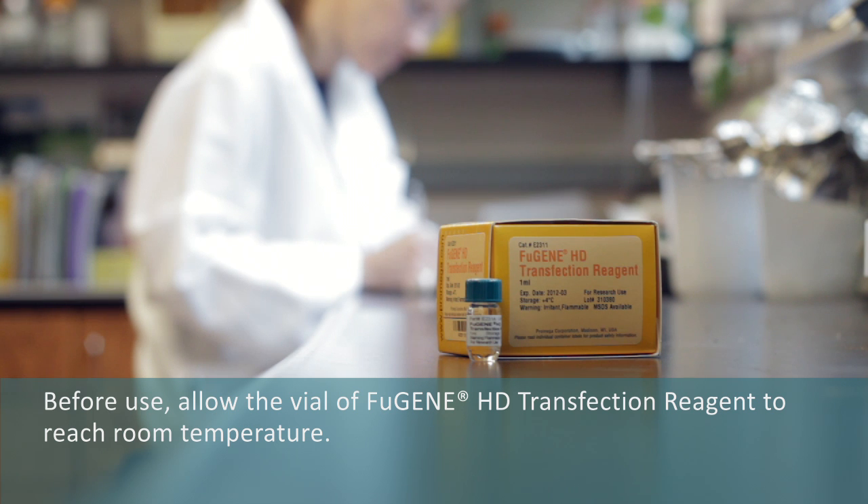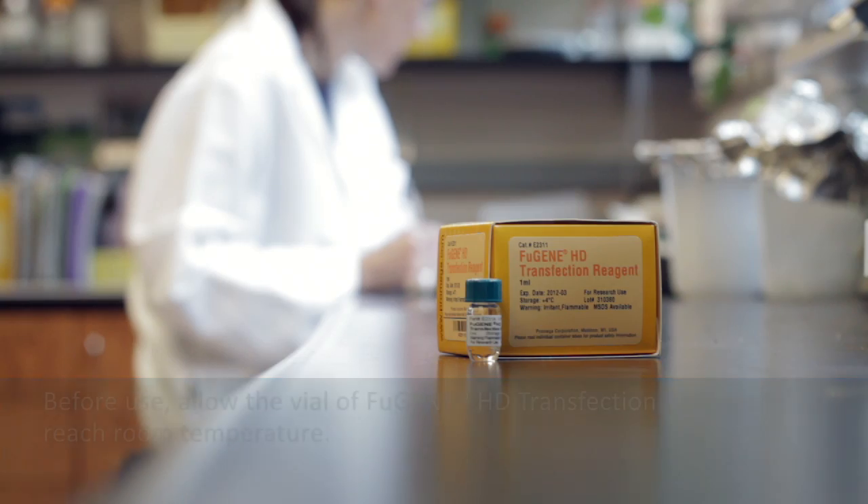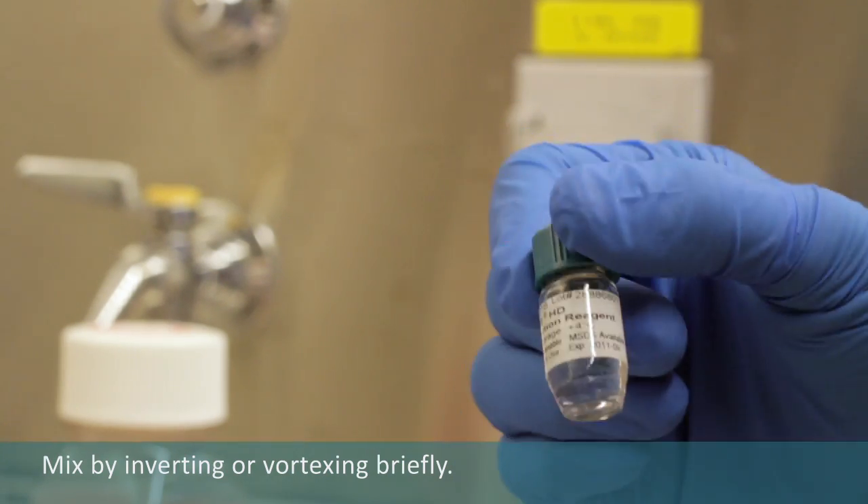Before use, allow the vial of Fugene HD transfection reagent to reach room temperature. Mix by inverting or vortexing briefly.